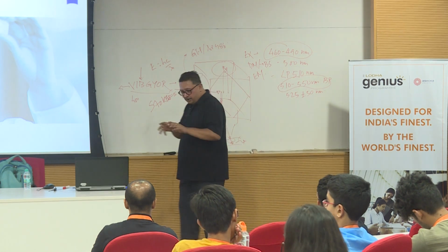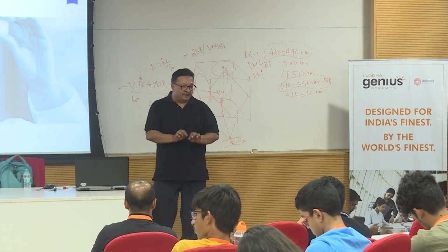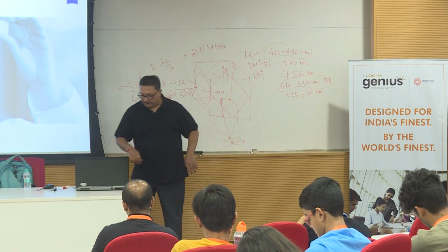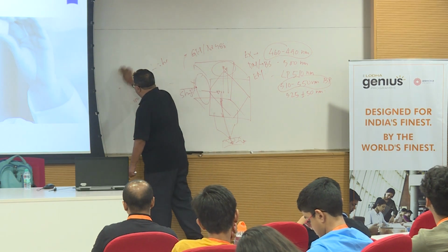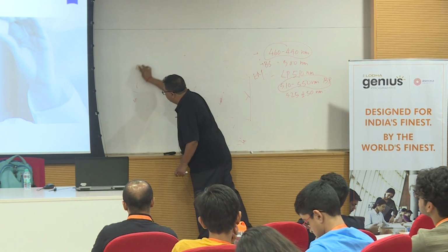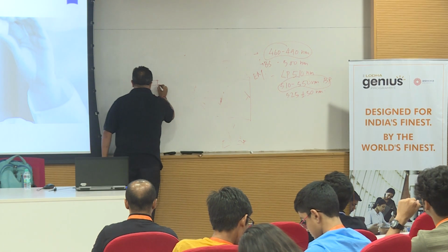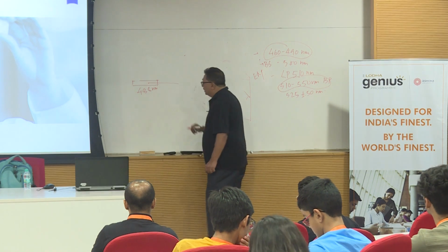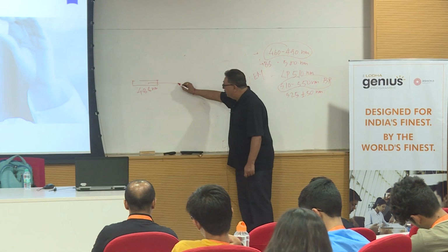Okay, so for your understanding, just understand that it is a coherent source of light and it has one particular wavelength to it. To make it very simple, that is how it looks like. And then what happens is, so then you have a laser. So it means that you have now got a laser which is exciting at a particular wavelength, say 488 nanometer, and then you have an optical fiber, the light source or optical fiber through which the light comes.